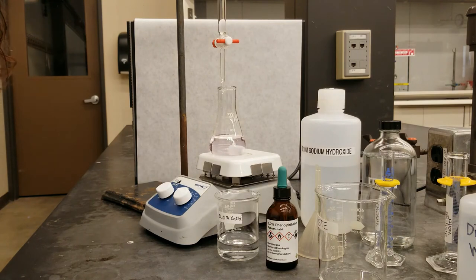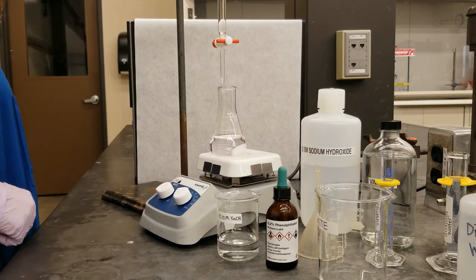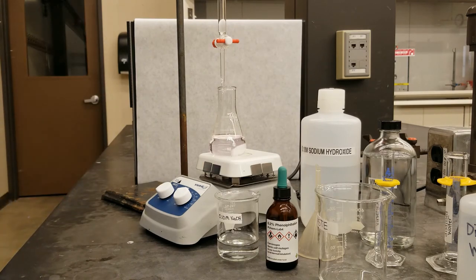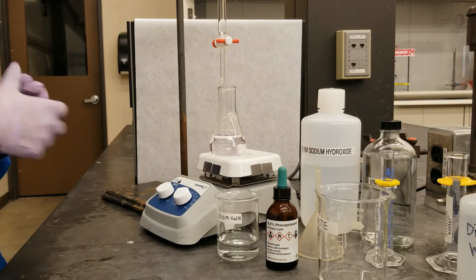And for my case, it is 42.1. Once complete, we can rerun this experiment for a second trial and then average our results.